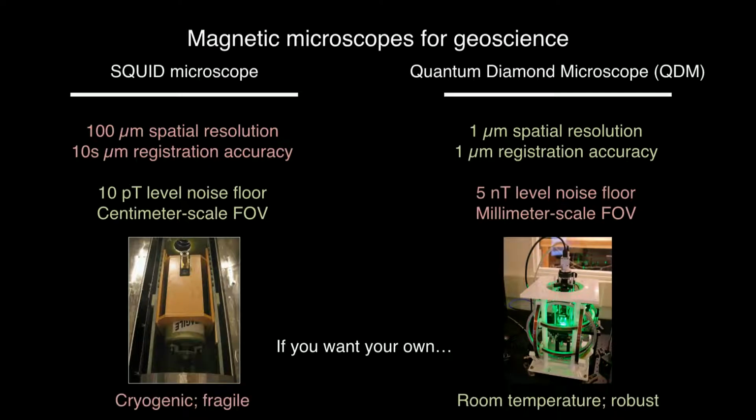If you actually want to build your own unit, there's more. You probably should know that the SQUID microscope is much more work intensive than the QDM to maintain. It's cryogenic. It breaks often, less often than it used to, but the QDM is quite robust.